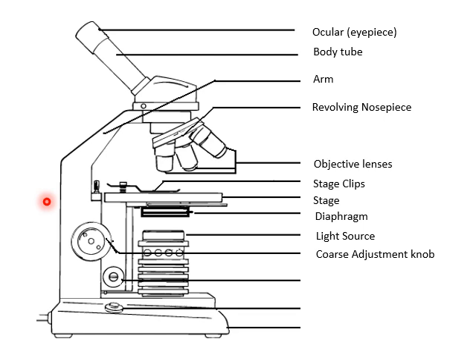But sometimes we want to look at more detail. So the detail one is this fine adjustment knob. So we're going to use the fine adjustment knob when we really want to get the detail in there, or maybe we want to look through the layers of a specimen. The fine adjustment knob is the knob that we're going to use. The other thing, and this is going to come up later, is we want to use the fine adjustment knob only when we're on high power, and I'll show you why later on. But that's when it's really, really important.